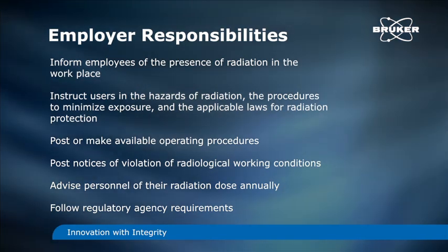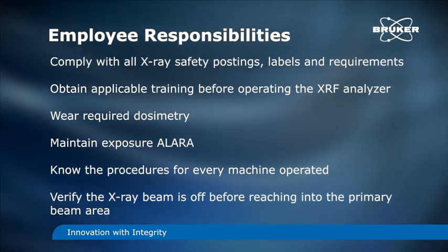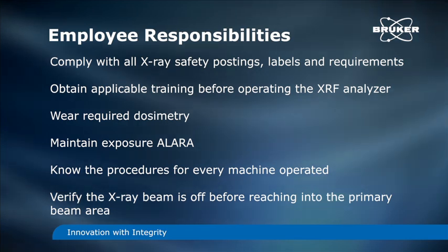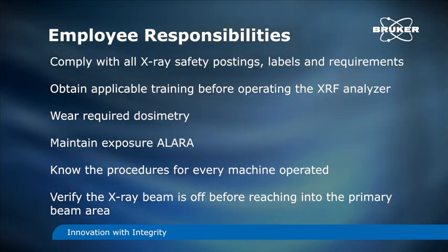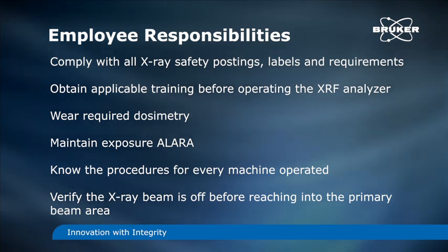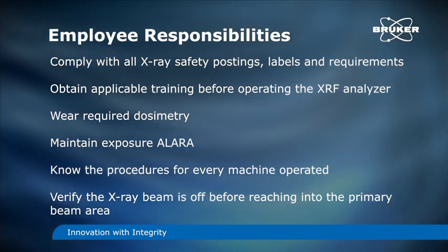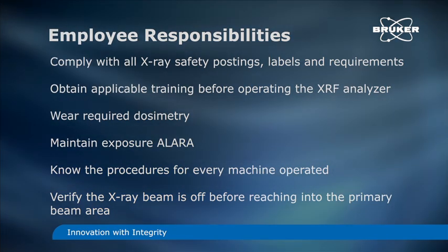Follow regulatory requirements. The employee has the responsibility to comply with employer X-ray safety postings and requirements. Obtain applicable training before operating the XRF analyzer. Wear required dosimetry. Maintain exposure ALARA. Know the procedures for every machine operated. Verify the X-ray beam is off before reaching into the primary beam area.